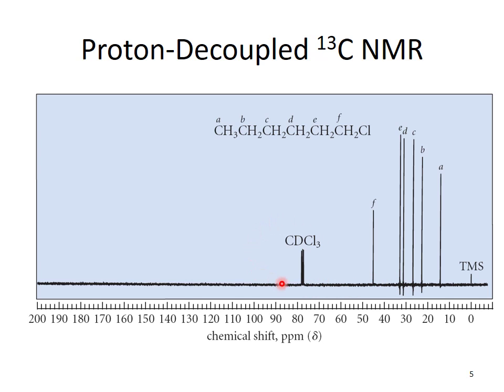Our solvent here is deuterated chloroform, and you see this is the peak due to it. You see that a lot in there. It's one of the most common solvents. And so when you see this little peak, it's really a triplet, 3 evenly spaced peaks, at about 78. You just ignore it. So we have 6 different carbons here, and we see 6 different peaks.